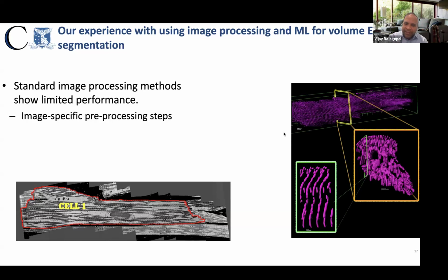But what we found is that when you work with algorithmic methods, it only really translates to another image stack that looks just like your image stack. And so it's a lot of work for not much scale up.